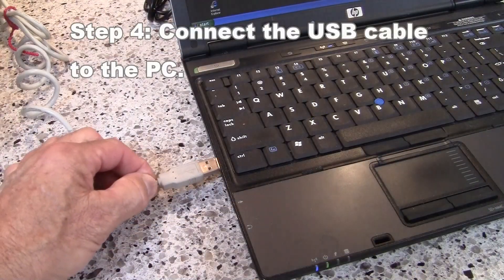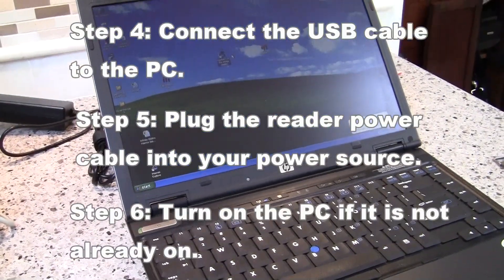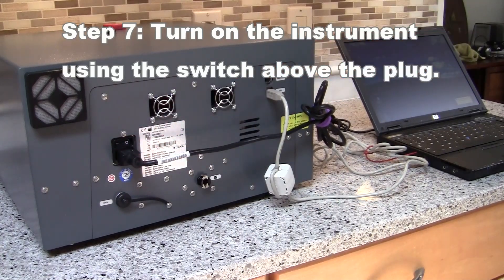Then plug the USB cable into the computer and the power cord into the wall. Turn on the PC if it's not already on. Then turn the instrument on using the switch located above the plug.